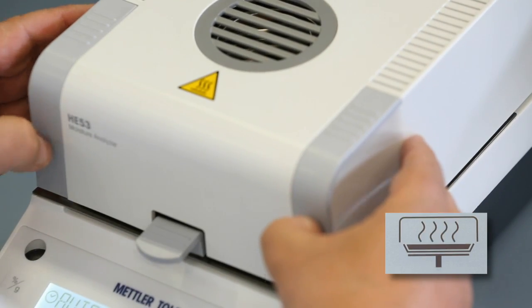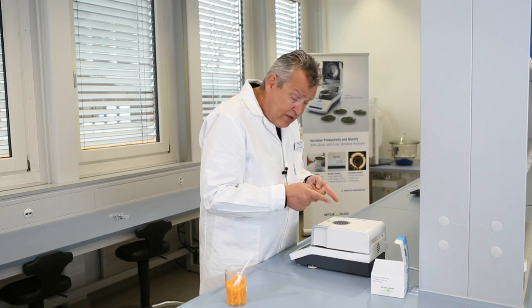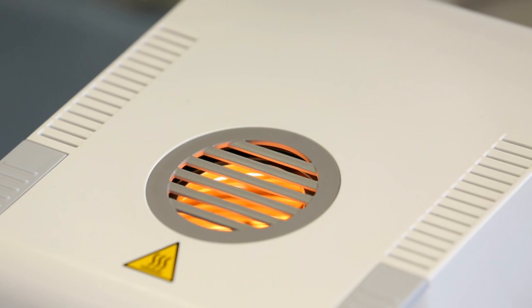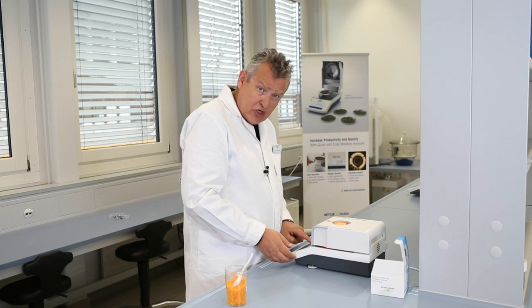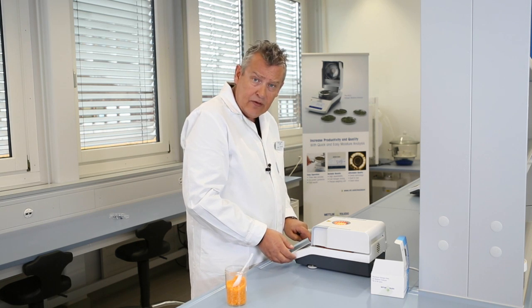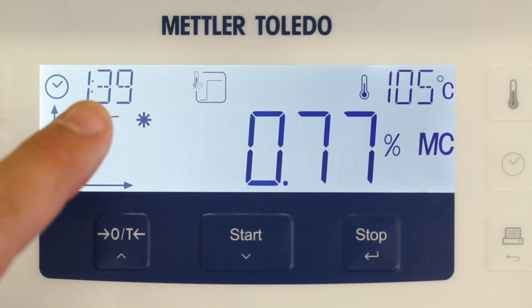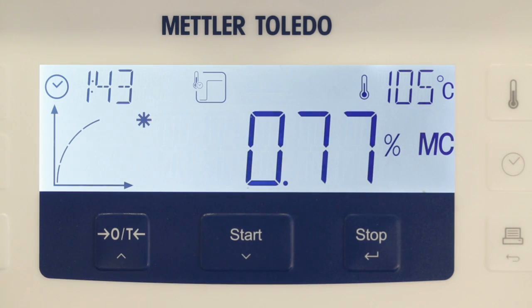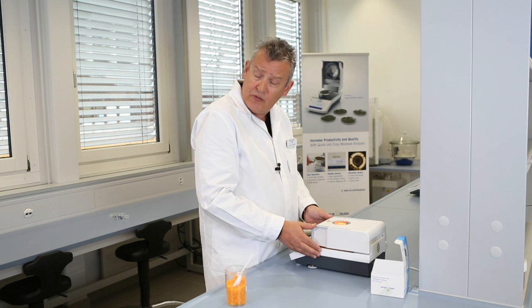Close the lid and press start. The instrument starts to heat immediately, as you can see from the halogen lamp. Notice the graphic indication on the display: you can see the current moisture content, the elapsed time, the current drying temperature, and the graphical progress indicator, which provides an overview of the measurement's progress.